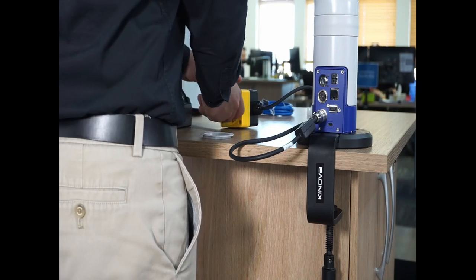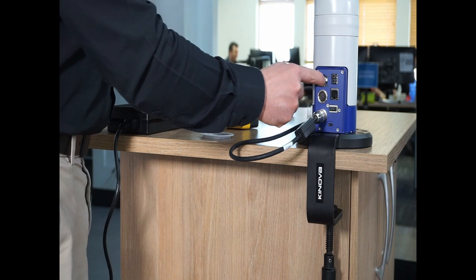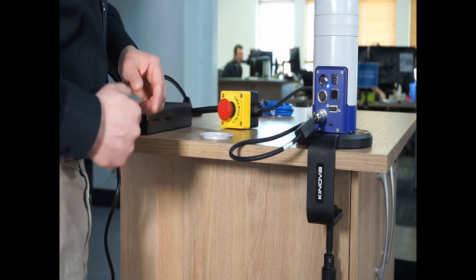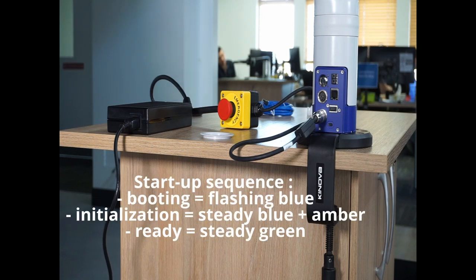Before powering on the robot, you must check that the emergency stop is turned to the right release position. Then, power on the robot by pushing the power button on the base controller. The LED will turn blue, and you will see the following startup sequence.